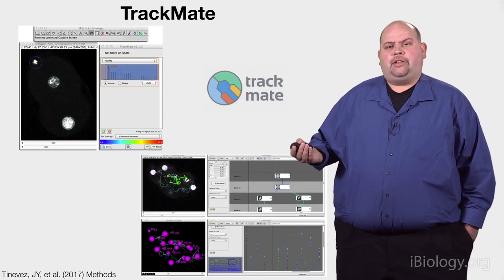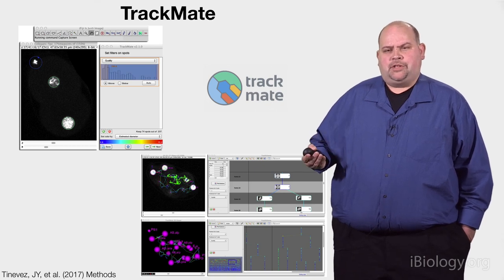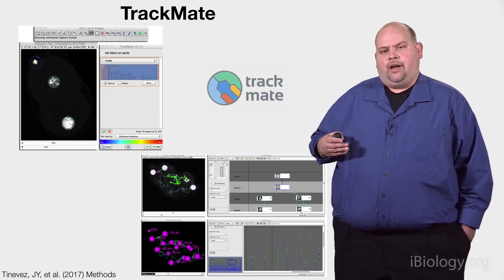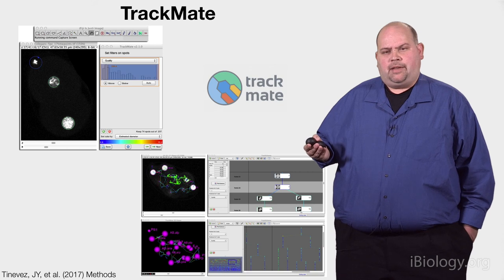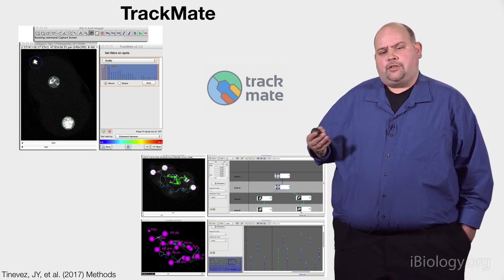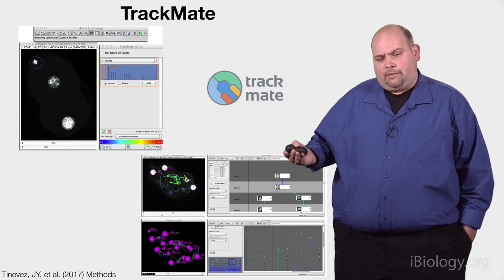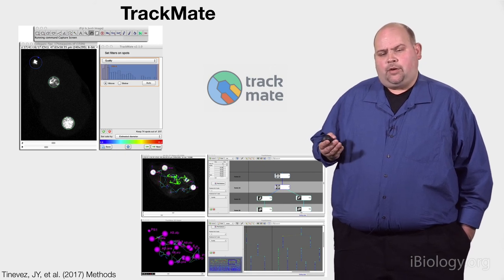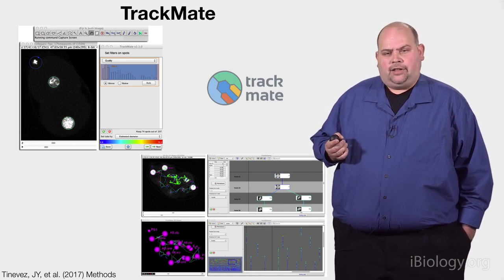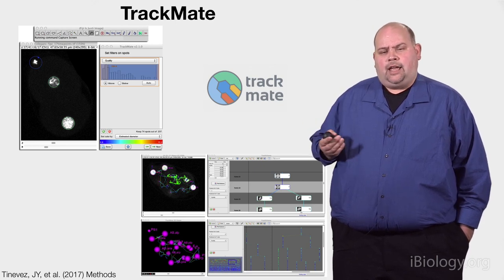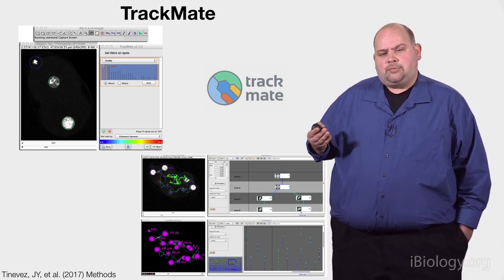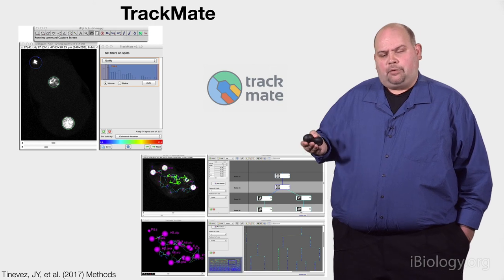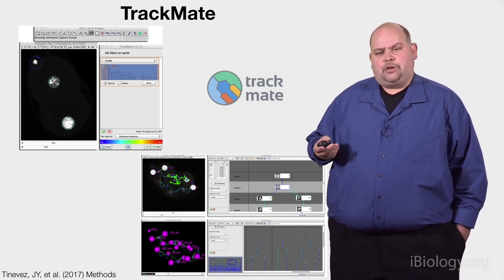Another plugin to highlight is the widely used TrackMate — a wonderful open source plugin for ImageJ and also part of Fiji — which is a great tool for tracking cells and objects. As we covered in the tracking part of our video series, tracking is a powerful method to track 2D and 3D objects, including viruses, particles, and cells over time and space. TrackMate is well-documented and well-published, and you can also extend it by adding your own linking algorithms.